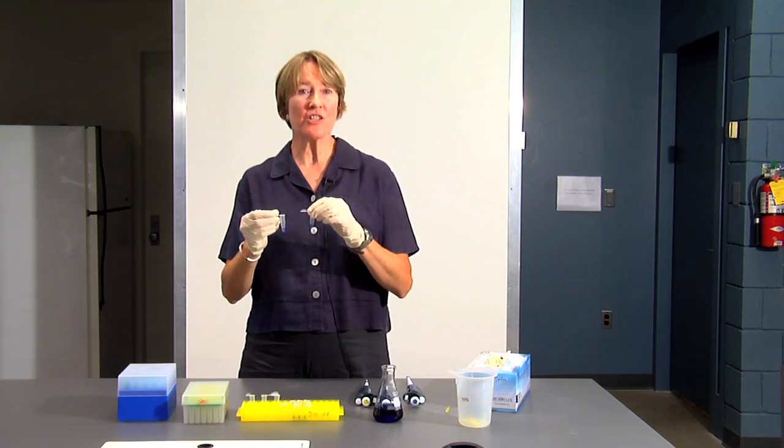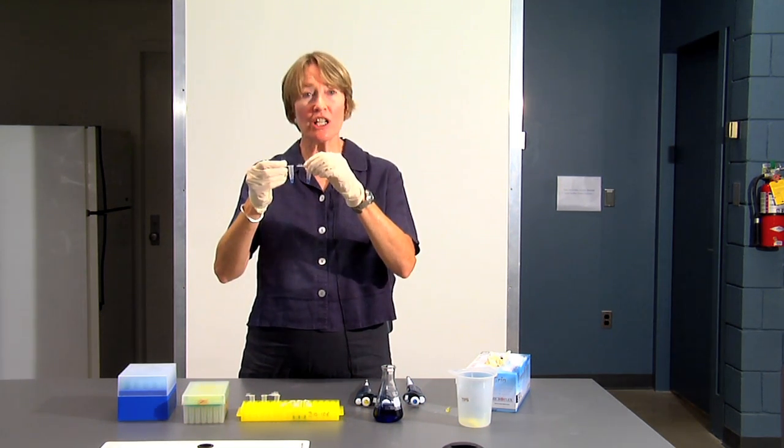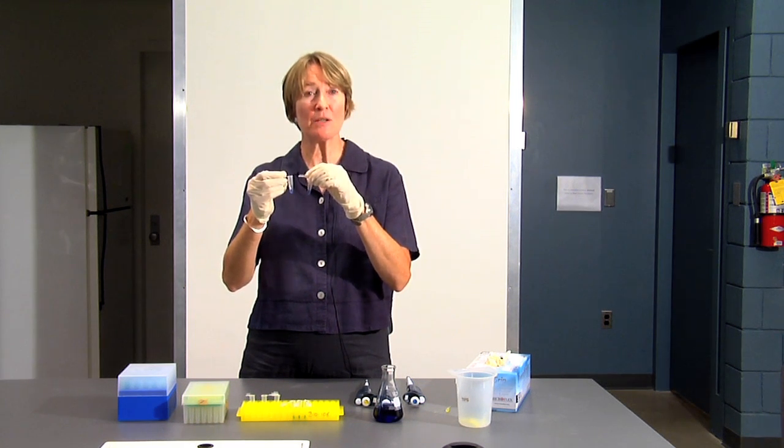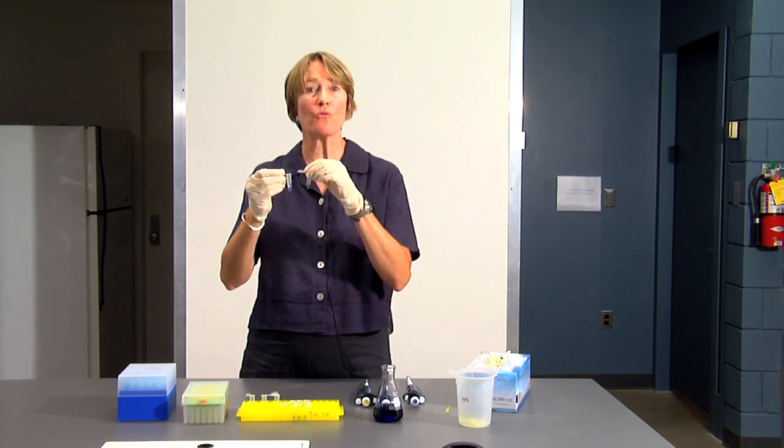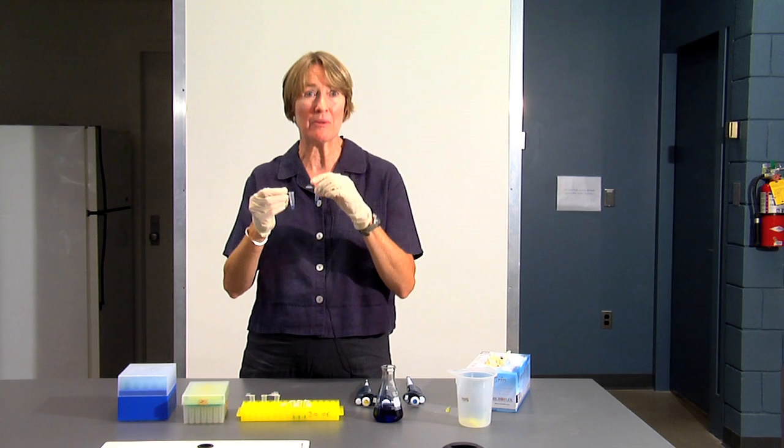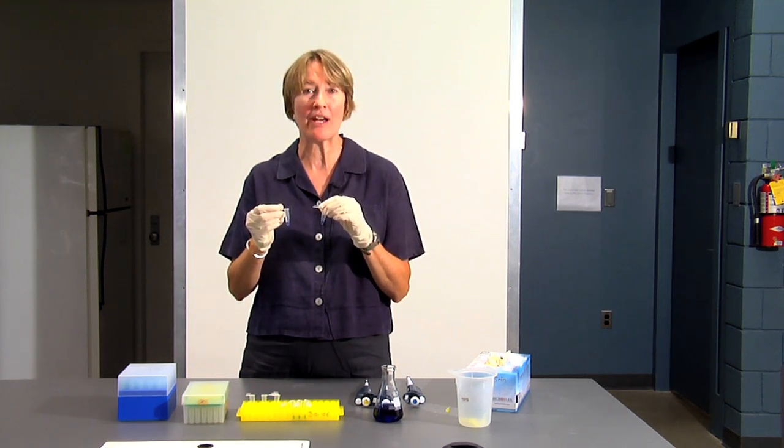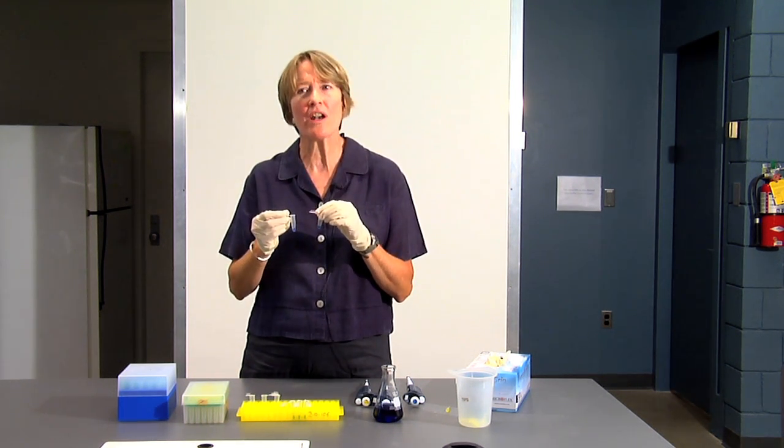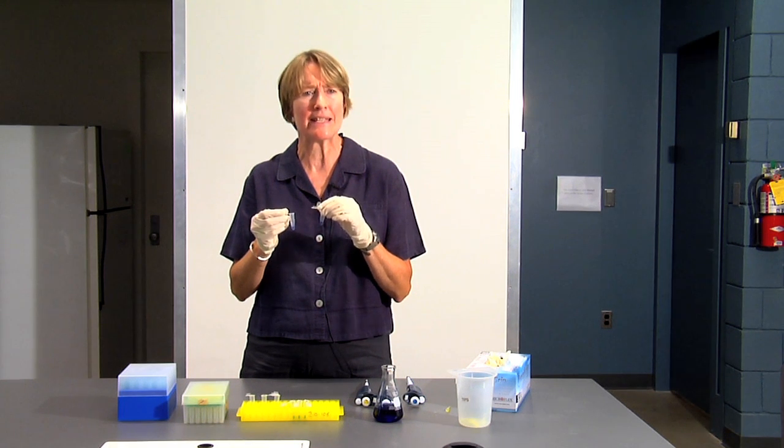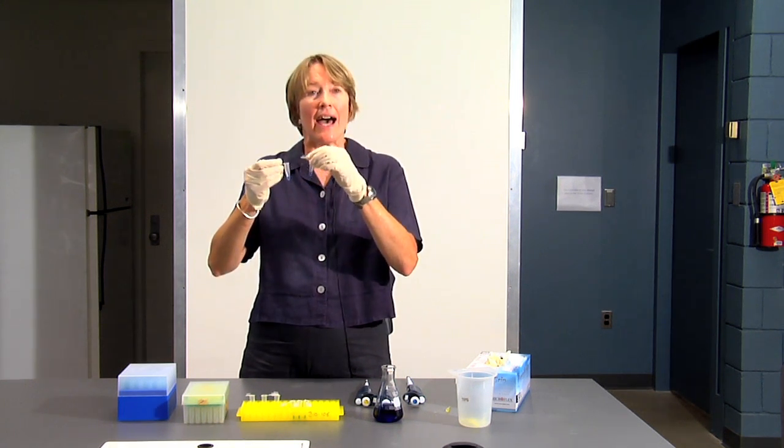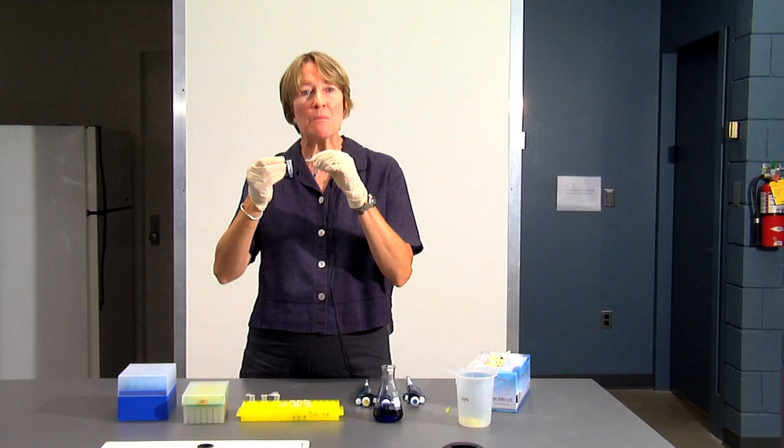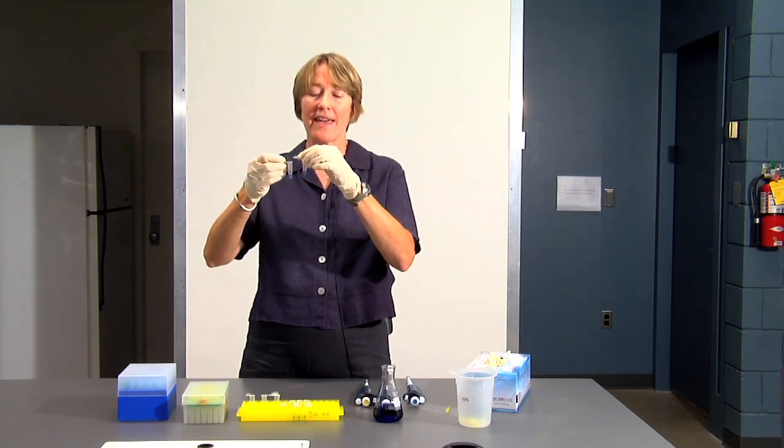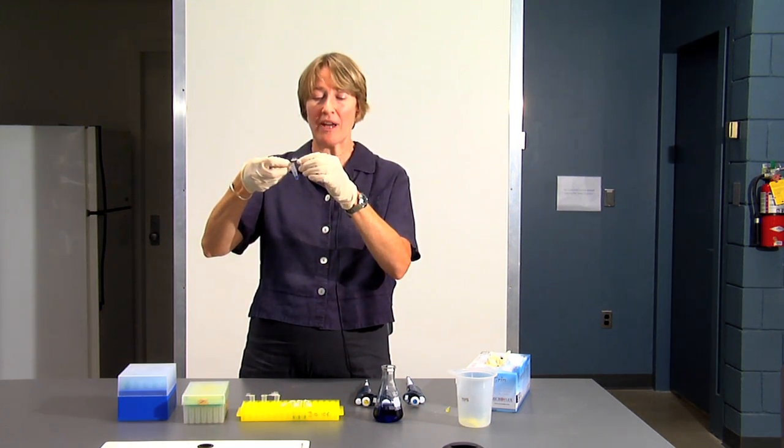Something that biologists often do when they're pipetting is they look at what they're pipetting and they check to make sure that they've pipetted the right amount in the tip. In other words, once I've pipetted 100 microliters over and over, I know what 100 microliters looks like in the tip. So I should be checking the tip to make sure that there are no bubbles and that we have 100 microliters in the tip.